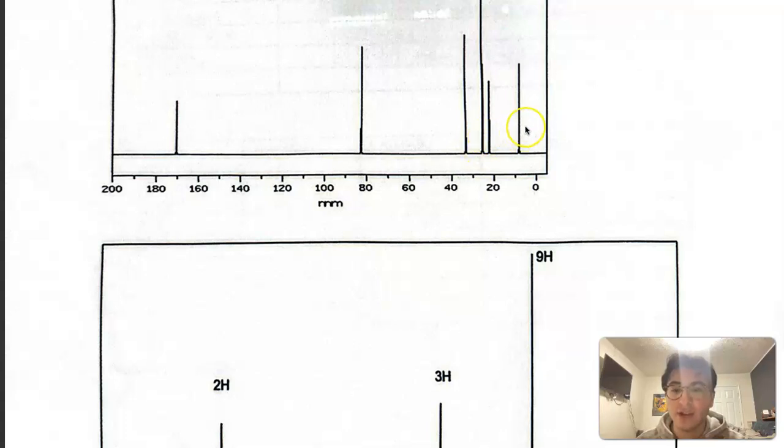And then these three peaks are representing the tert-butyl, because since they're so far upfield, that is farther away from the carbonyl or the O part of the ester. So for that reason, usually the C13 and H-NMR kind of go hand in hand: this represents that, this represents this, and then this represents these three.